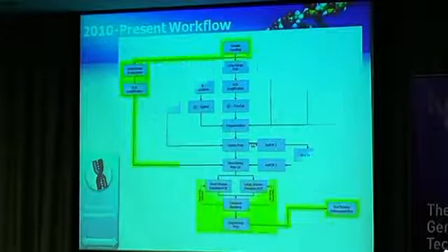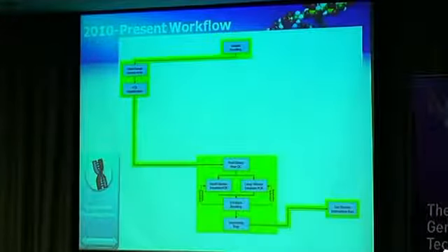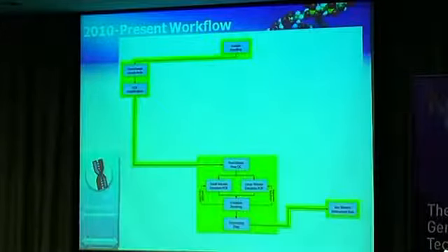And I think what we're going to see is really we're going to start feeding just the Ion Torrent systems, with the Proton being able to handle your high-level exome, potentially whole genome, transcriptome. You can really start to see, or I can start to see, phasing out some of the other instruments that we have.